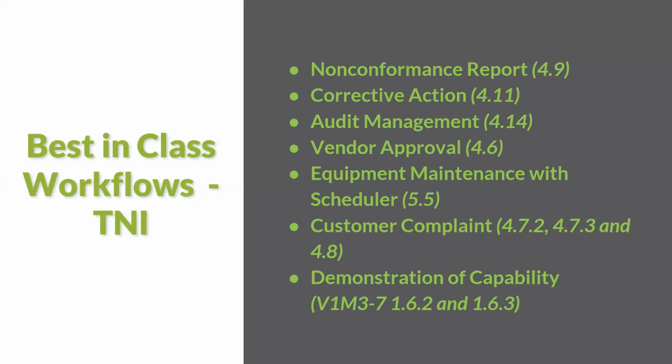These are also designed to work together in a lot of ways, right? And that should be a pretty key feature for any system you're with. Most of these are not standalone processes that you do in silo, right? If I'm doing a non-conformance report where somebody is presenting a potential non-conformance and I'm reviewing that, I want to be able to take that a step further and do corrective actions if needed. These workflows are tied together.